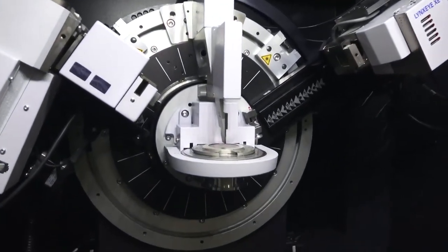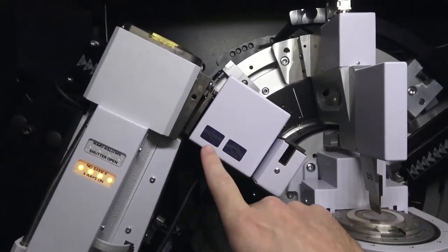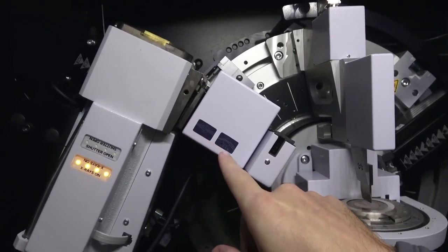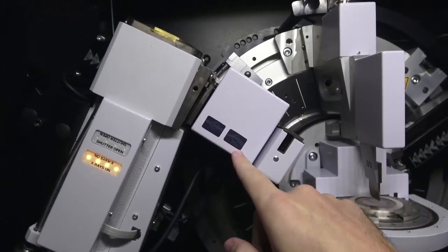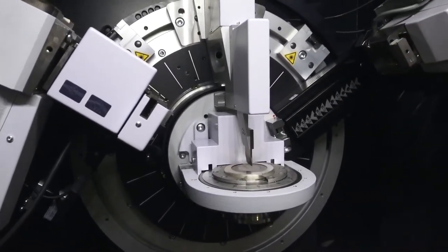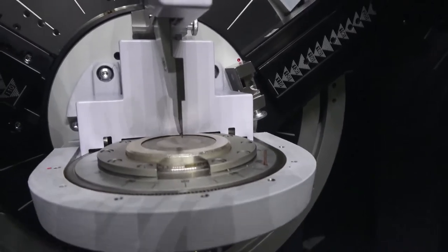So now, I also noticed on the primary side that there were two little stickers on the enclosure of that box. Yep. On this primary optic, we have two stickers because we have two different beam paths. We have our motorized slit, and then the second one here, if we want, we could switch to a Goebel mirror, which will give us a parallel beam. Okay. And so all of these components, we can control those through the software? Right, because they all have motors attached to them, we can control the opening and switch back and forth to a parallel beam all in the software.